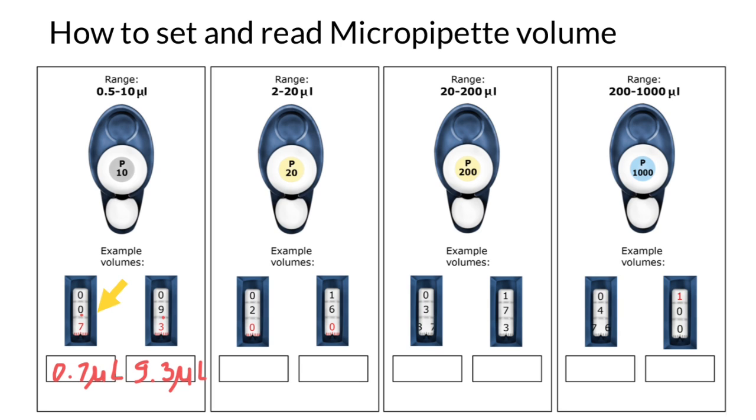Now let's move to the next micropipette, which is P20. That means that all the readings we can get here are between 2 and 20 microliters. Again, we put this decimal point here and here. So now we understand that on the left, we have 2.0 microliters and on the right, it is not 160, it is 16.0 microliters.